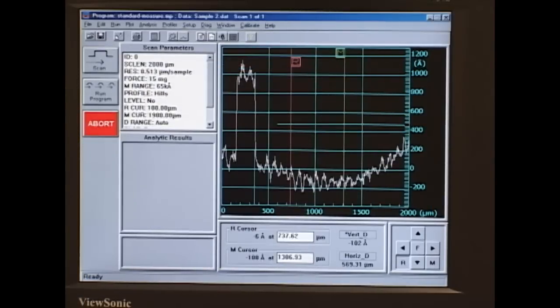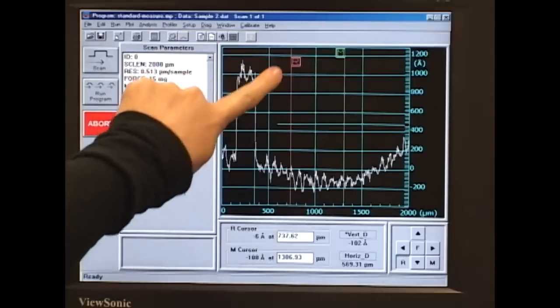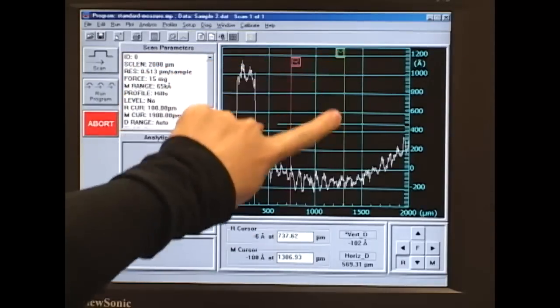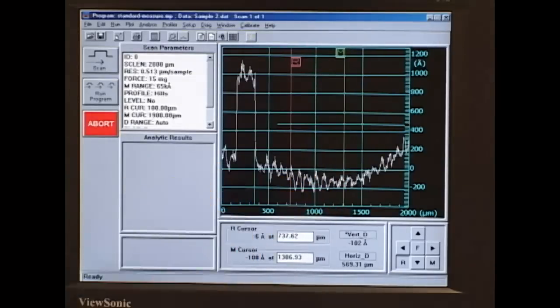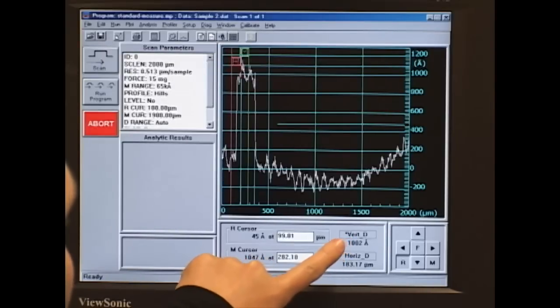So once we're ready to take measurements of our scan, we'll use these lines, this R line that goes all the way vertically up and down the scan, and the M line. And what we'll do is we'll move these two lines in order to make our measurements. So we'll take the cursor, we grab the R, and that moves the entire line. We'll put it at the base of our measurement. And we'll take the M line and move it to the top of the feature. And now we'll be able to determine the vertical height of the feature. And that information is located right here, Vertical D. And that measurement is 1,002 angstroms.